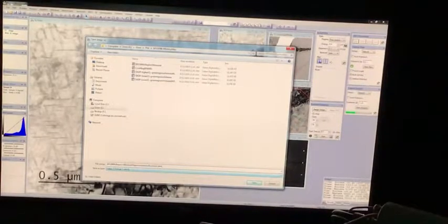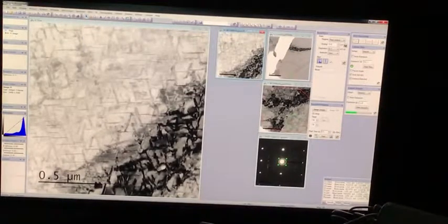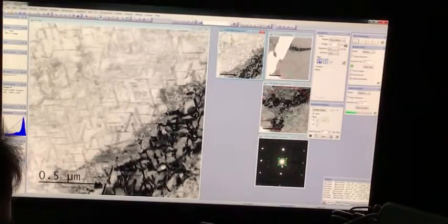And I've made a spelling mistake there. Objective aperture. Well, I'm going to make abbreviations because these file names are going to get ridiculously long. So it's going to be POS1, objective app, POS1. And I'm going to put an annotation in there, show the position 1.